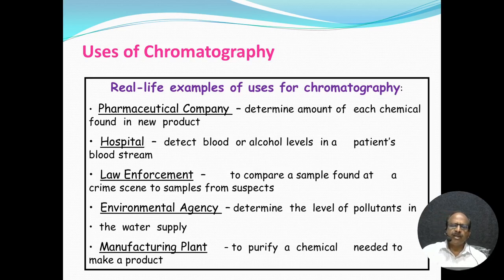We take a chemical reaction from one to five steps. From one step to the second step, you get another product. Is that product correct or not? What ingredients are present? What is the percentage of our target material present in that particular sample? We have to analyze how much quantity is present in the first step. That is also in the pharmaceutical industry, and then we go to the second step, the second to third step.